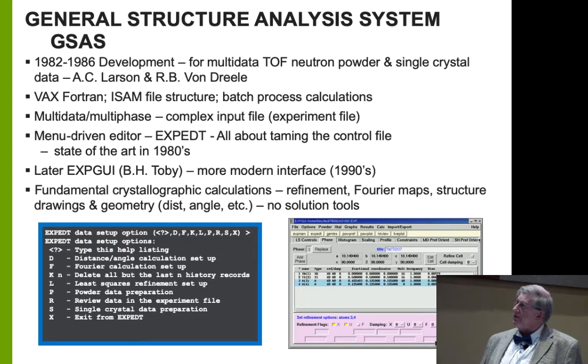Brian then said, well, this is not good for beginners. So he wrote ExpGUI, which is a graphical user interface to do much of what this does. Didn't cover everything, but it certainly covered all the essentials. And it had all the usual sorts of stuff, pull downs and buttons and fill in the blanks and all that kind of thing that you expect to see in a GUI.